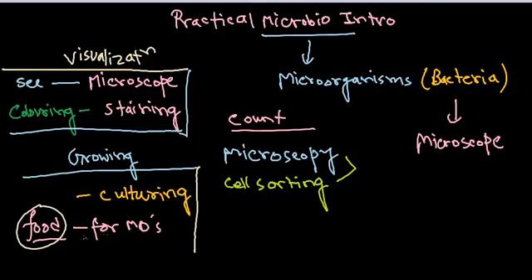The food for the microorganisms are called culture media. Remember, they are called culture media. So in the culture media, whether there are microorganisms or not, how you can look for them? To know that, there is a very basic process, and that basic process is simply the colorimetric process. Simply you need to check the OD, right?